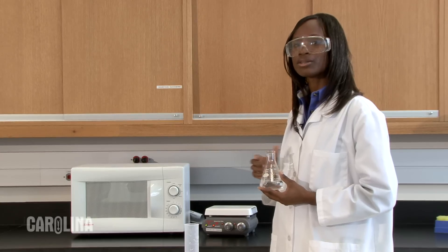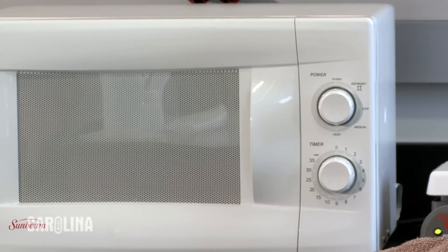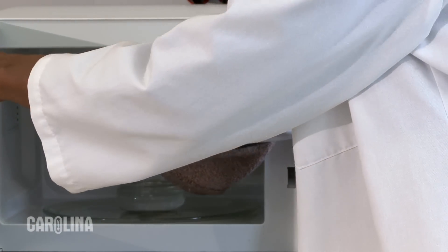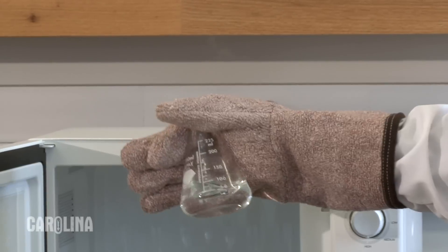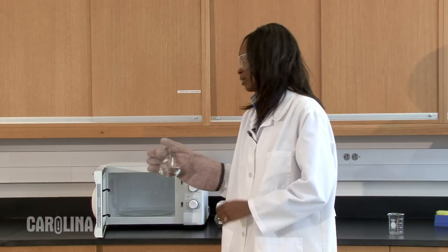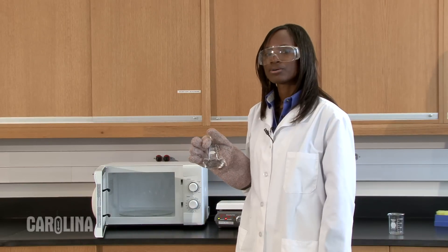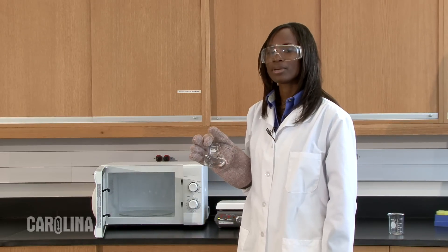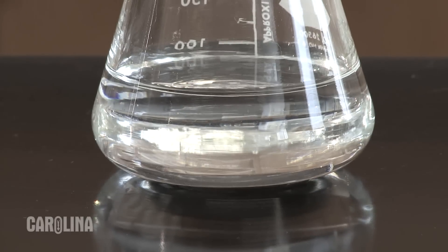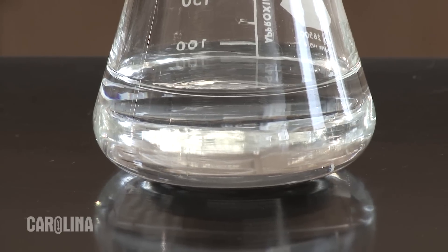Dissolve the agarose either in a microwave or on a hot plate. Whether you heat the flask in a microwave or on a hot plate, watch the flask carefully. Once it becomes hot, swirl it every minute or so to prevent boiling over. Depending on the volume of agarose used, it may take anywhere from 2 to 30 minutes for the agarose to completely melt, so plan ahead. The agarose is completely melted when you see no particulate matter if you hold the flask up to the light — it will look like water.